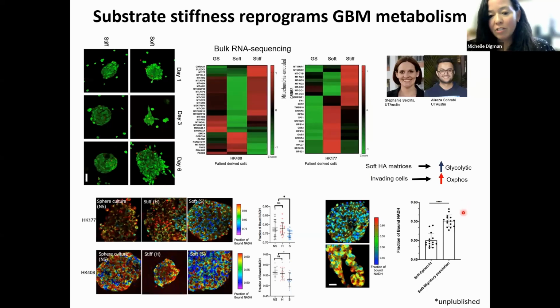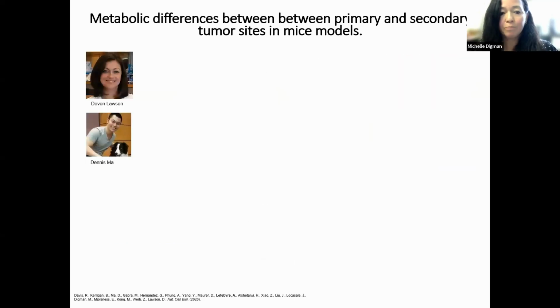And that was really interesting, because what that told us is that with FLIM imaging, we have the capability of looking at single cell analysis and monitoring their metabolic profiles, as opposed to doing a bulk overview analysis, right? So bulk RNA-seq data didn't pick that up, but neither did our imaging here, because we weren't specifically selecting these cells that were protruding out of the soft material. So that correlated with our previous work.